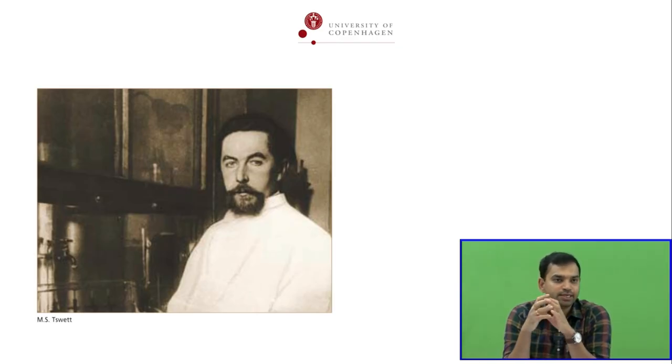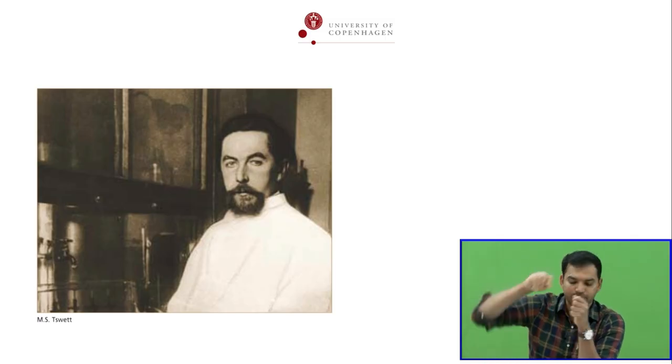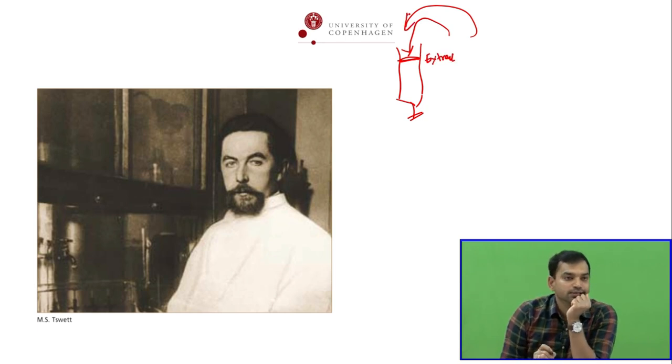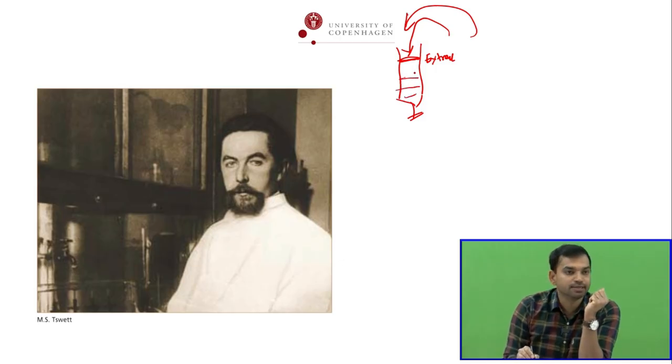What did he do? He crushed these leaves and put them into a solvent, I think ethyl acetate or something like that. Then he loaded it into this small calcium carbonate column, like this one. Then he poured more solvent and loaded the sample, the extract of leaf. Then he added more and more solvent. He could visually see the separation of colored bands.